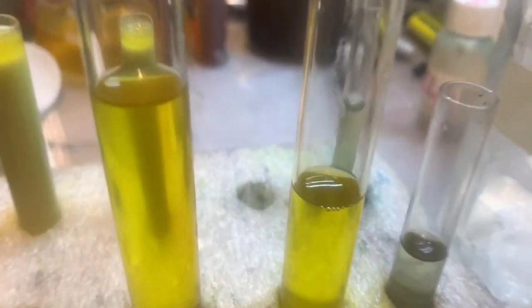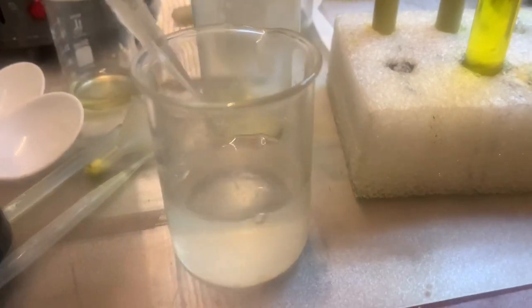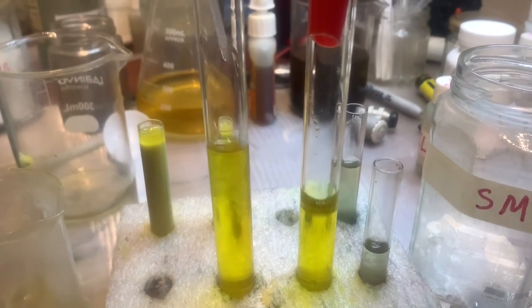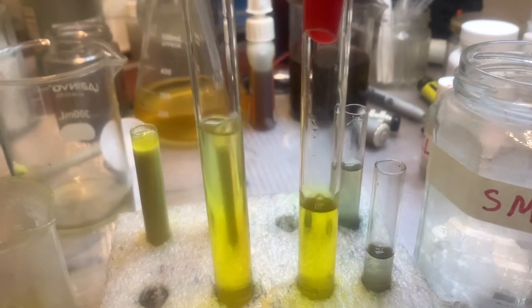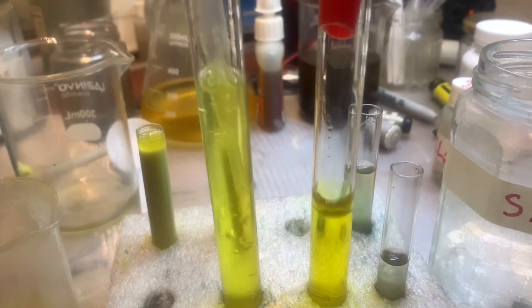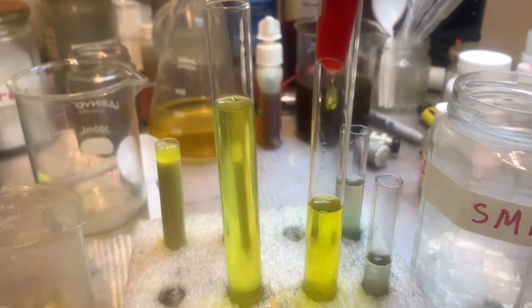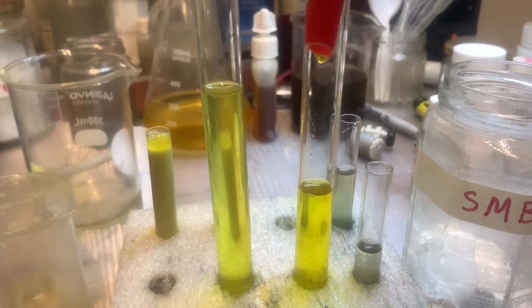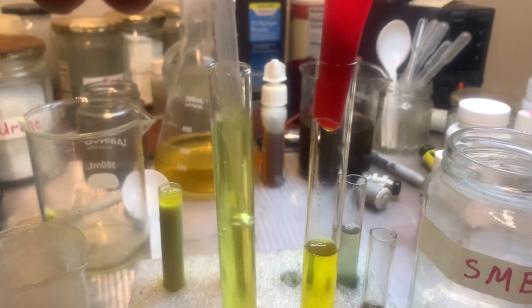Here. Almost clean, guys, it's almost fine. And I see already everything dissolved, so we can start adding SMB in those beakers. So you see the reaction doesn't start right away, because there is not a lot of gold. But it works. Just need to wait.